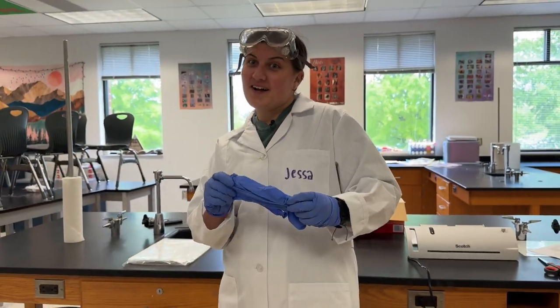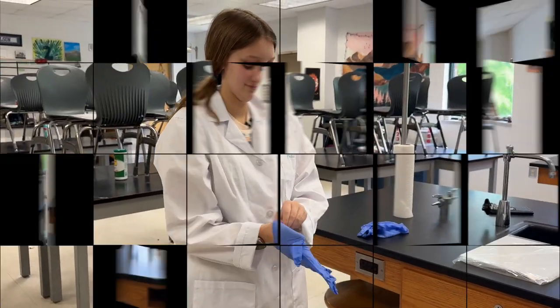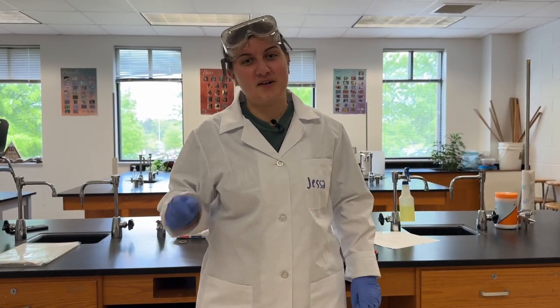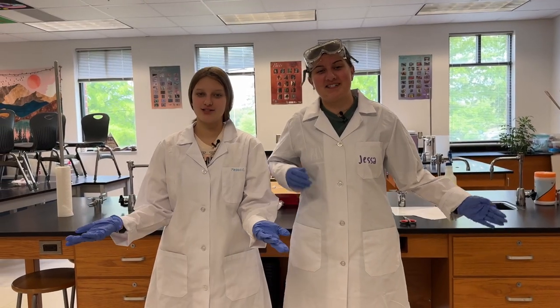Don't forget gloves. And don't forget close-toed shoes, because there's so much glassware in the lab, we don't want your feet to get cut up. And now we're ready to do a lab.